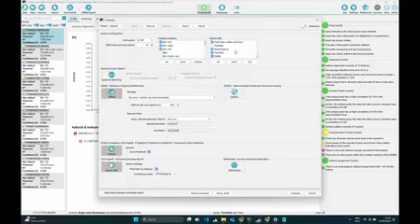If you hit bio here, which is also the default, it will preselect all databases we think are of biological relevance. They are not specific for humans or something like that. So it really just depends on what database you select. If you select databases that are fungi related, then you can find fungi related compounds.